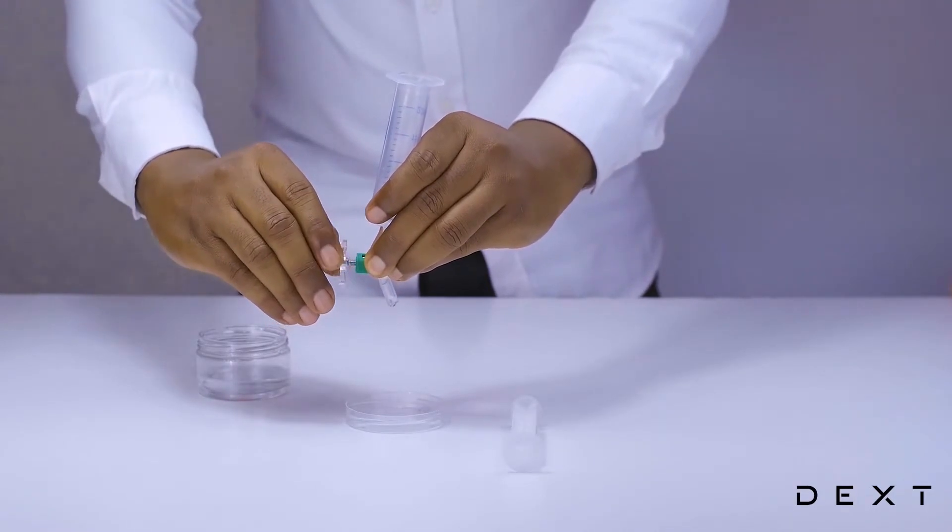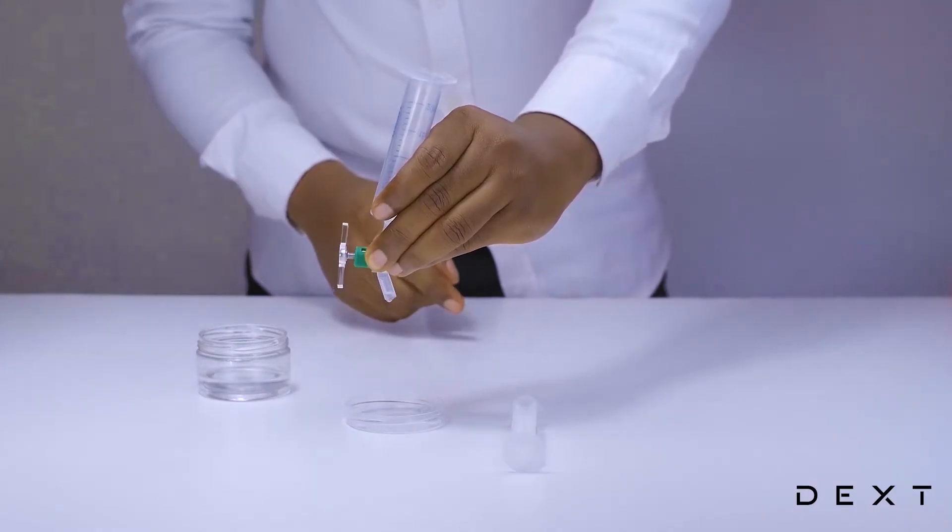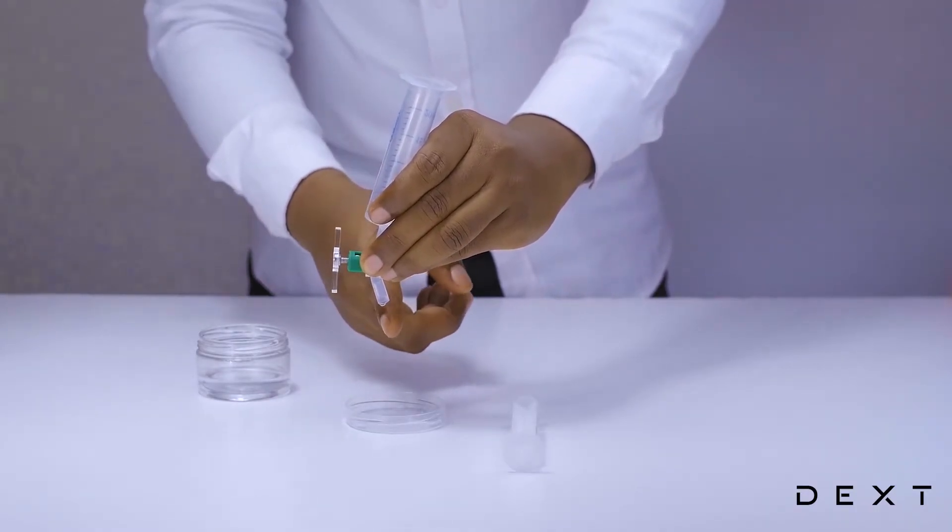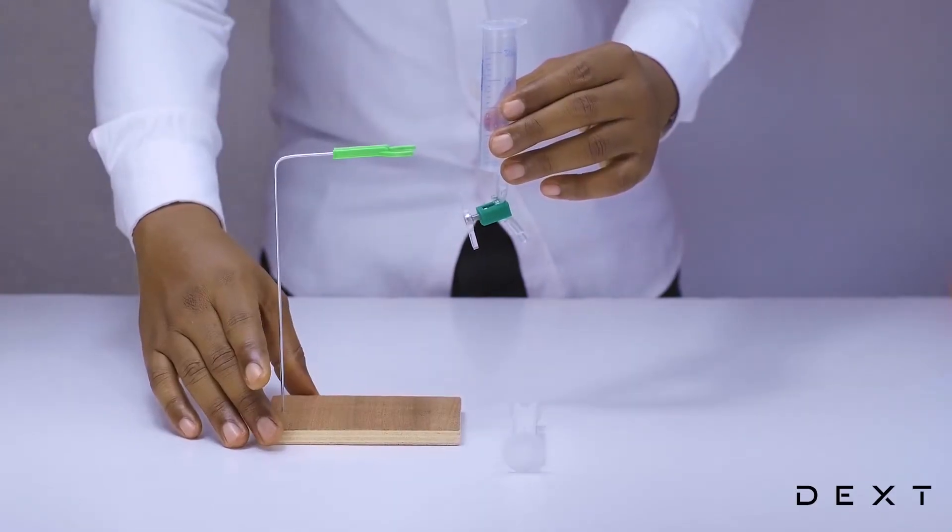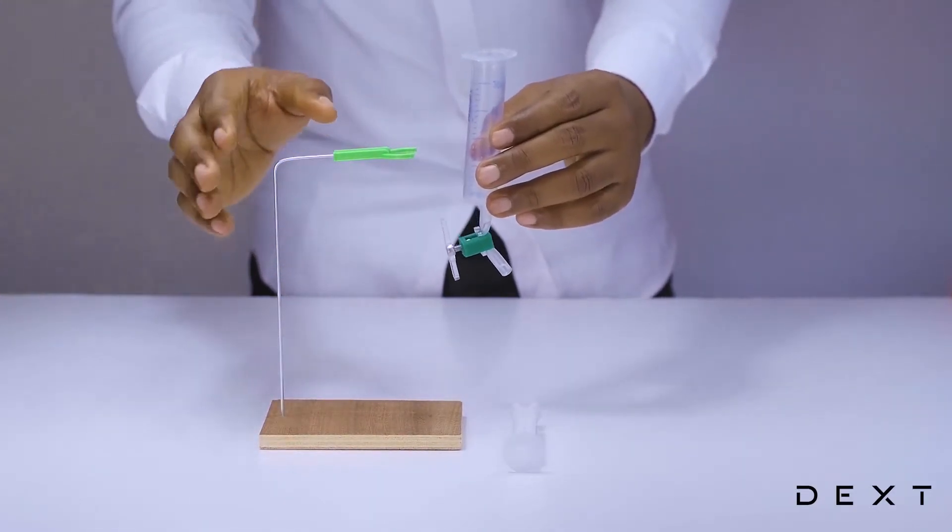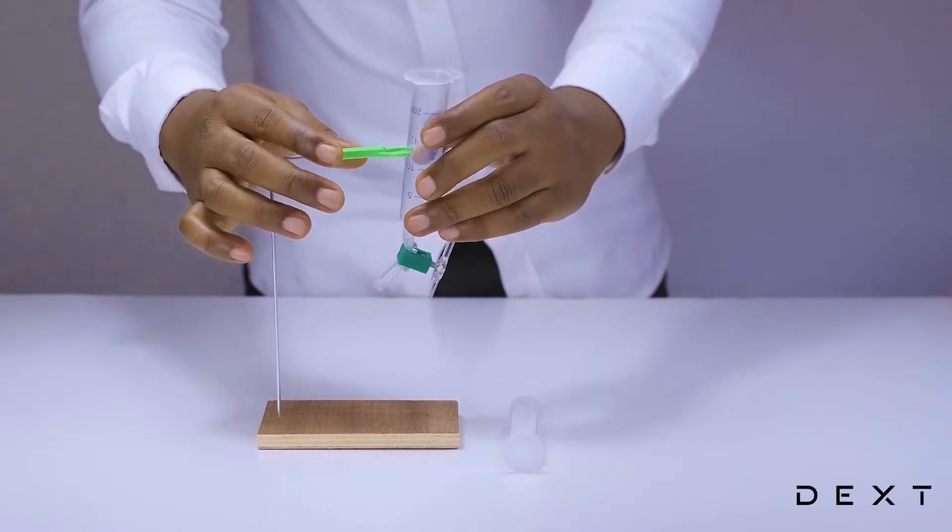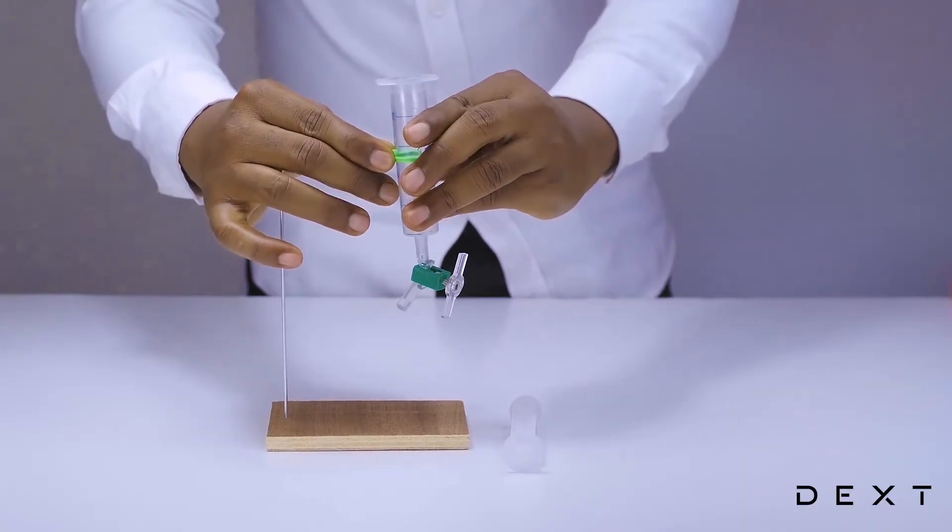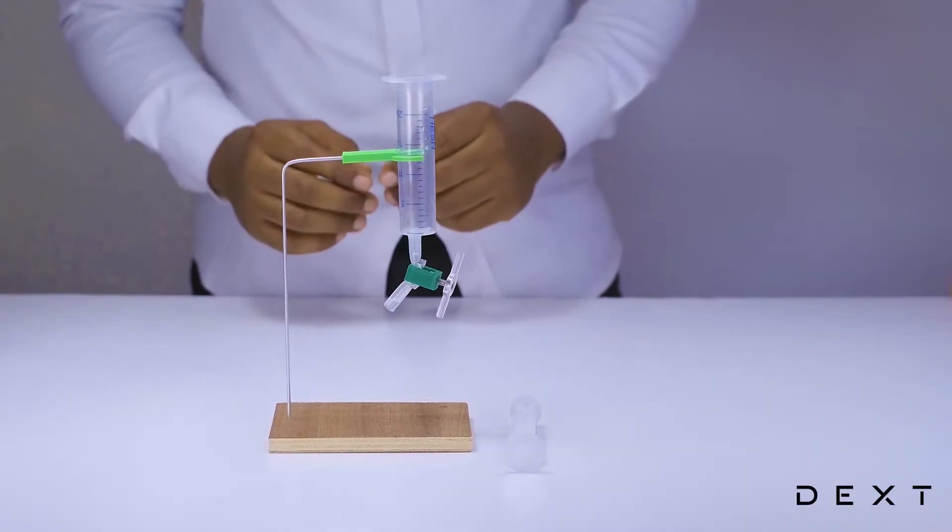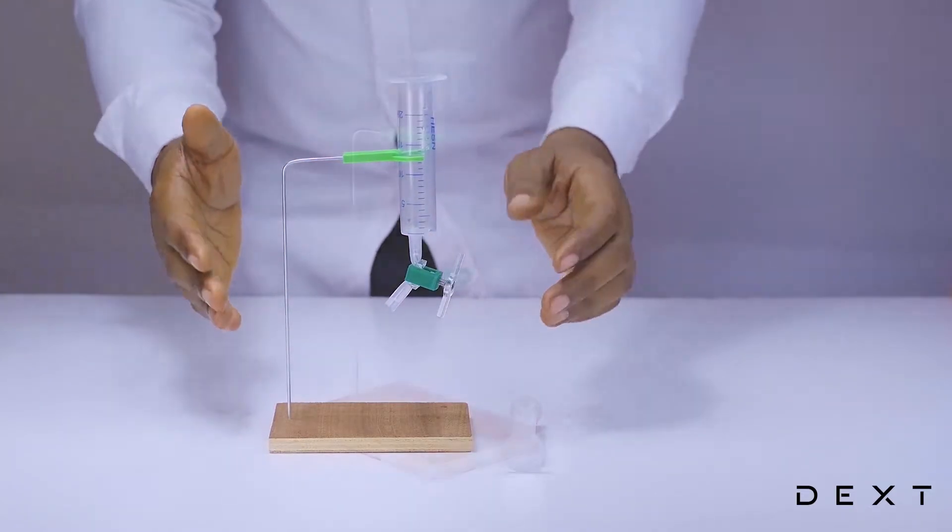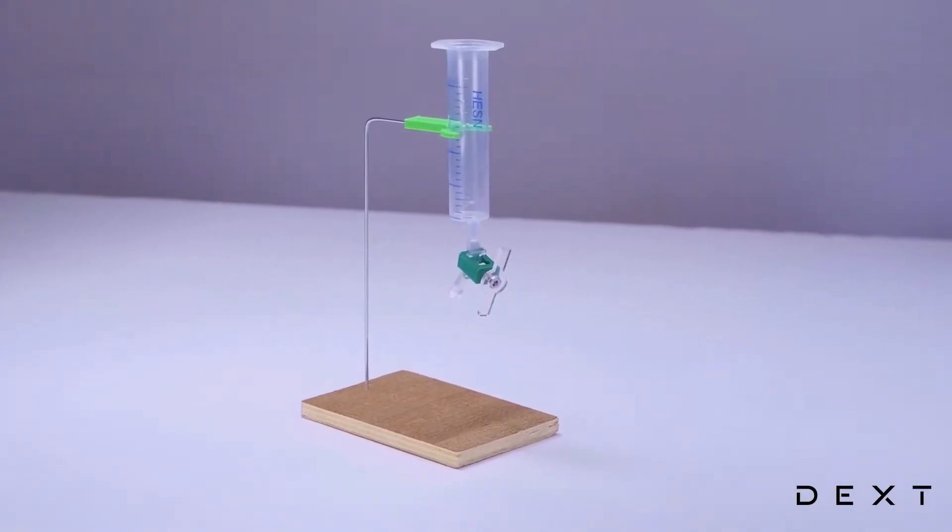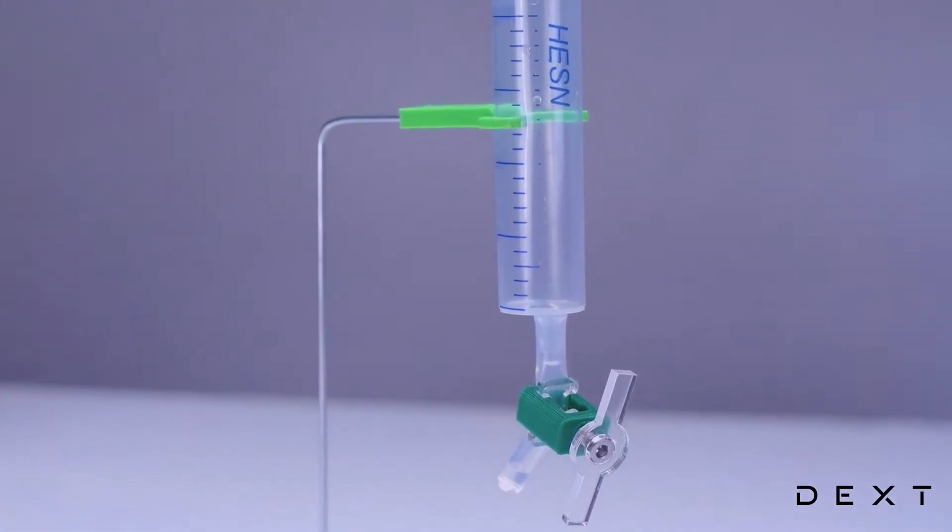Again, be careful not to tighten too much so as not to break your plastic piece. Now that the whole thing is set, we are going to place it gently onto our plastic holder. And once that is done, there you have a very simple setup with your improvised separating funnel to separate some immiscible liquids.